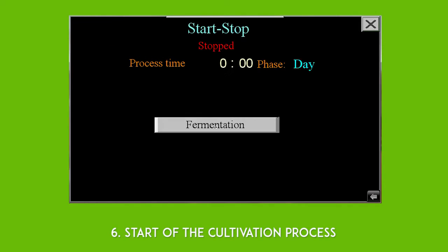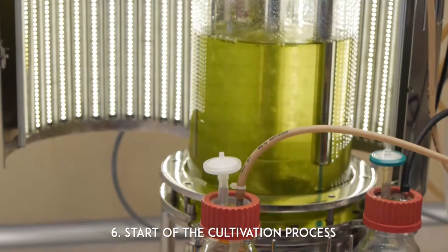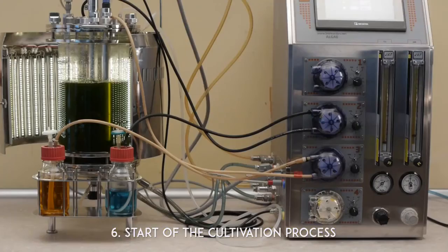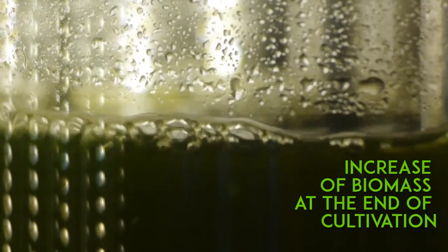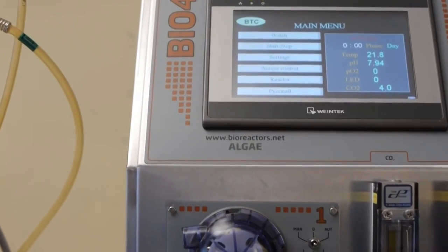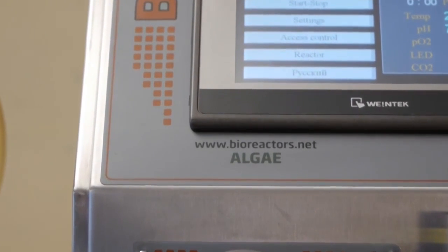Start of the cultivation process. If all preparation is completed, the process can be run. Increase of biomass at the end of cultivation. For more information, visit our website bioreactors.net. Thank you.